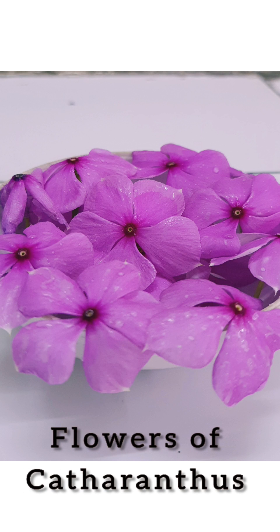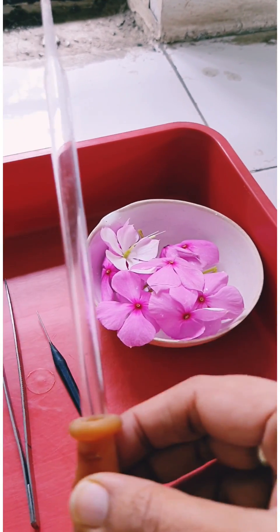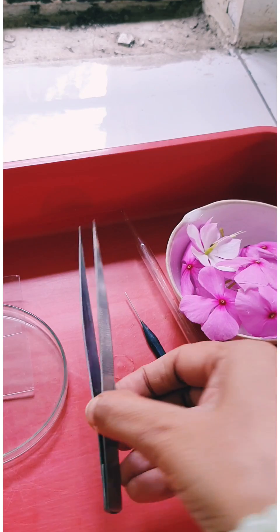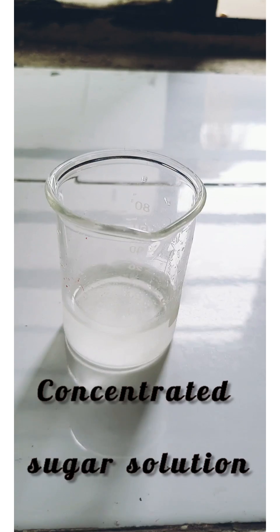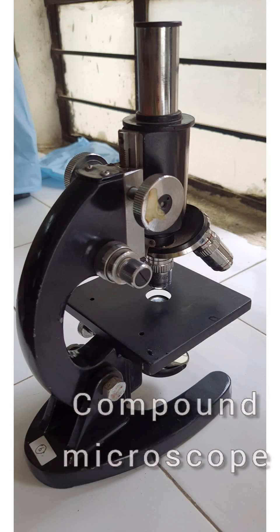Hello students, today we are going to start the experiment study of pollen germination on slide, for which we require periwinkle flower, dropper, needle, forcep, slide and cover slip, concentrated sugar solution, and compound microscope.